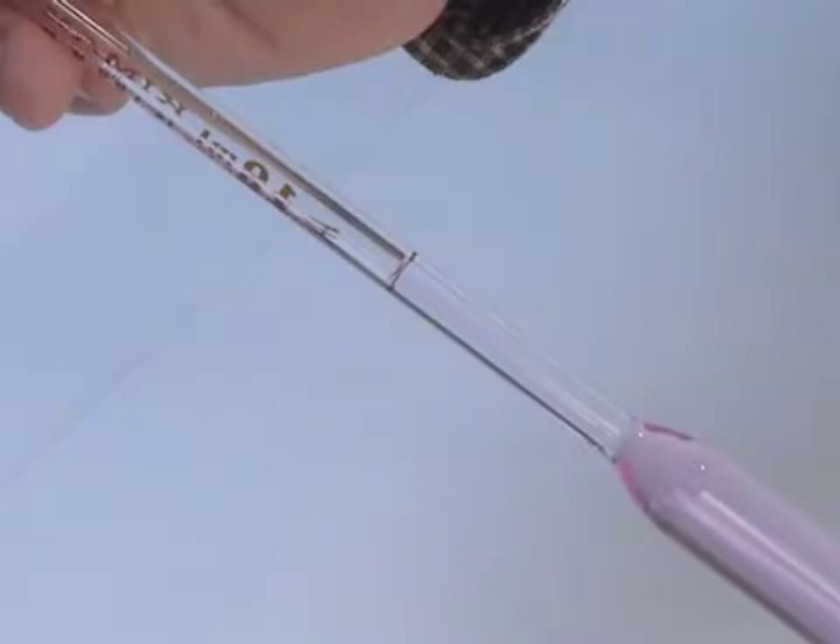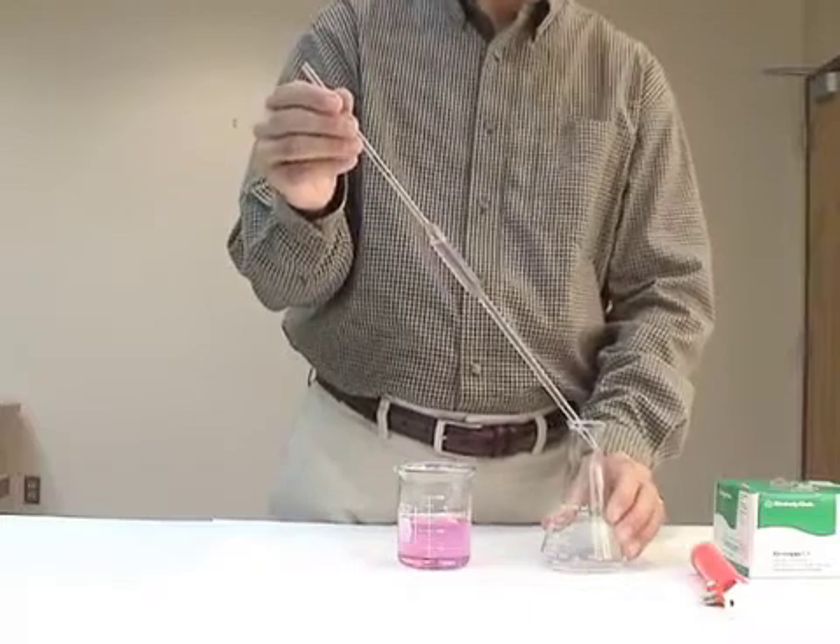Remove any drops that might be hanging from the tip of the pipette by touching it briefly to the side of the beaker.